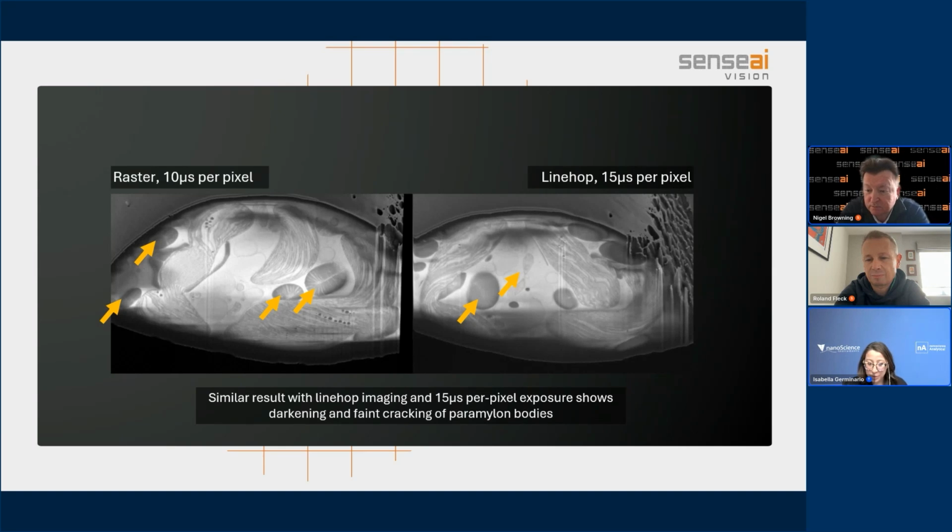Okay, next question is pretty straightforward. Can this be implemented for lamella preparation for cryo-ET in a cryo-vEM? There's no reason not to. On the other hand, I tend not to look at the lamella particularly closely with the vEM, really from the perspective of trying to reduce any beam damage or beam interaction on the sample before I get to the TEM.